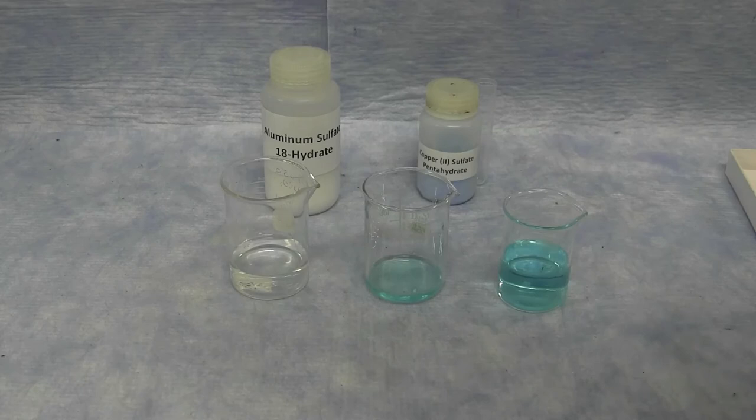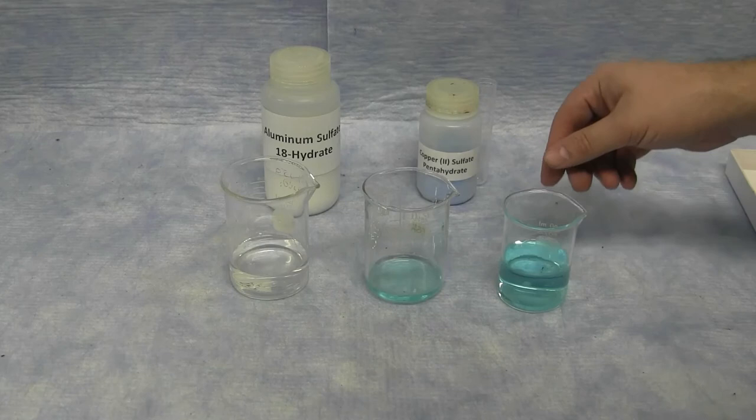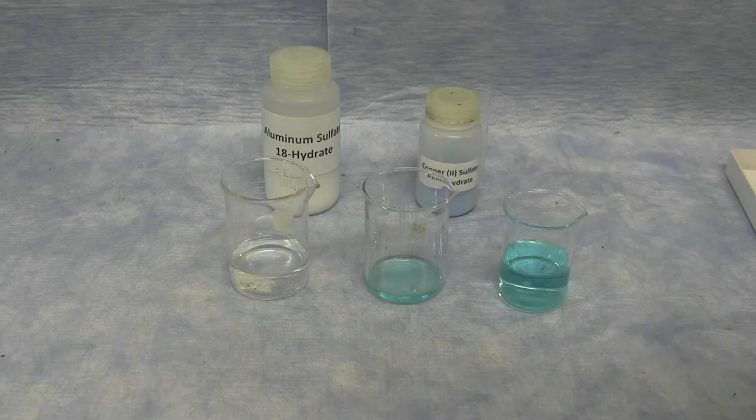With all three solutions prepared, you will then take the absorbance reading at the indicated wavelength of each of your three solutions. Each colored transition metal salt will have a different wavelength, which you will calibrate the spectrophotometer for. You will then measure the percent transmittance of each of your three solutions.